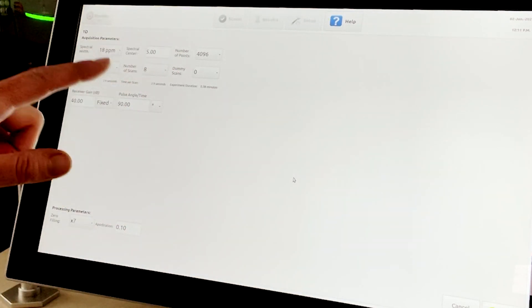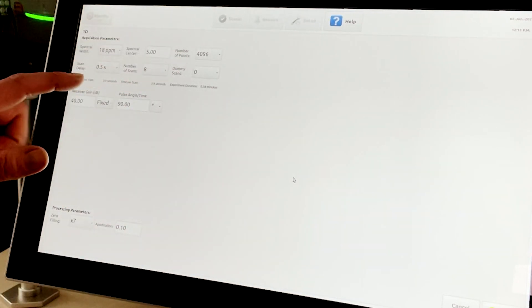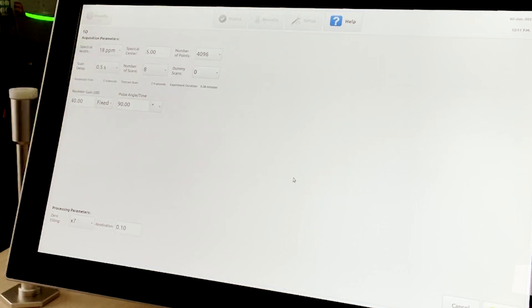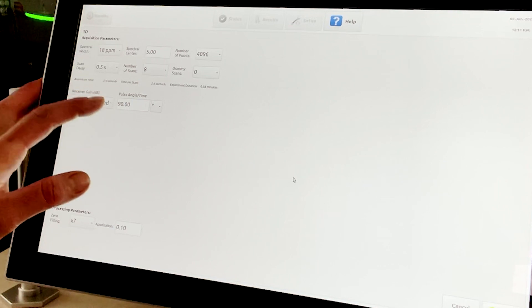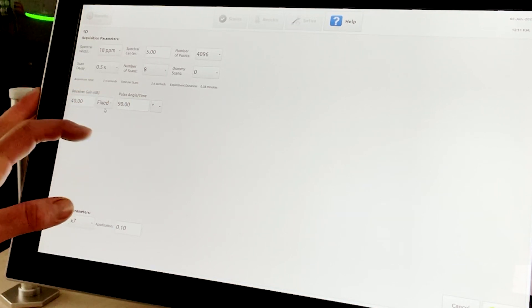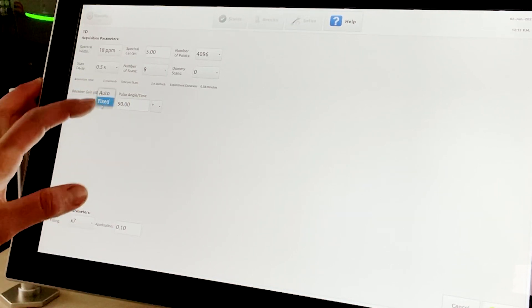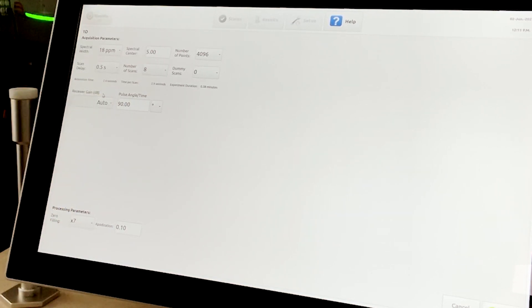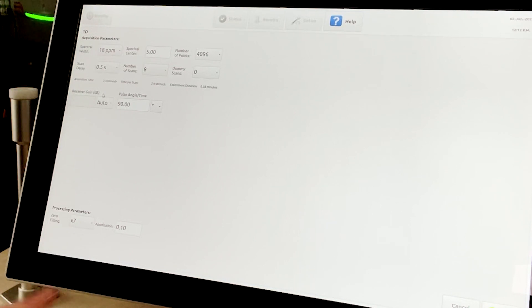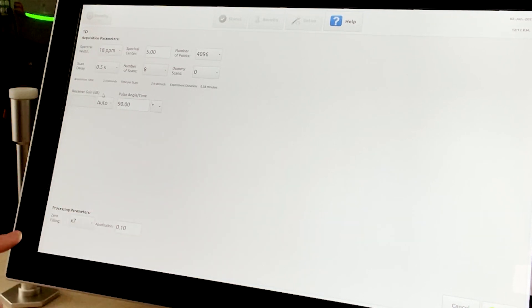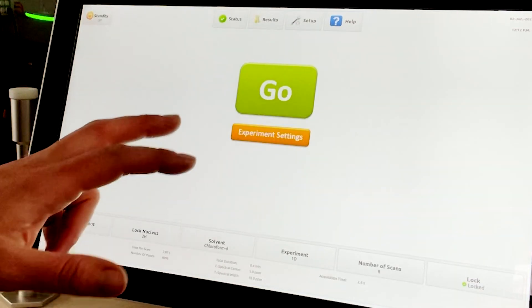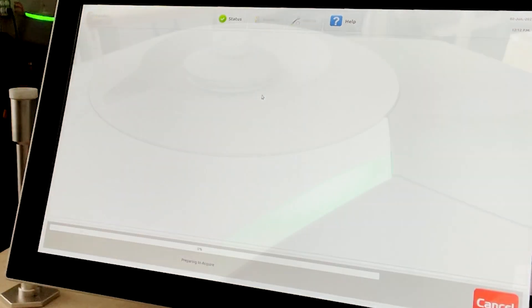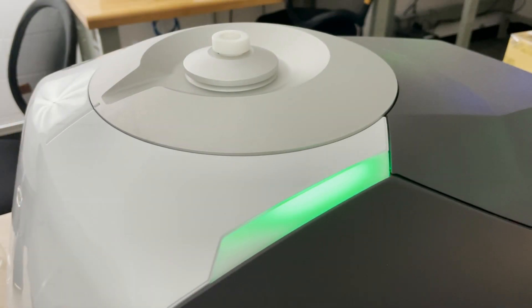The user can select a fixed or an auto receiver gain, and the pulse angle can be modified to balance relaxation time and sensitivity. The user can modify zero fill and apodization prior to the acquisition or in post-processing as desired. Once satisfied with the experiment parameters, the user returns to the main window and selects the big green Go button.